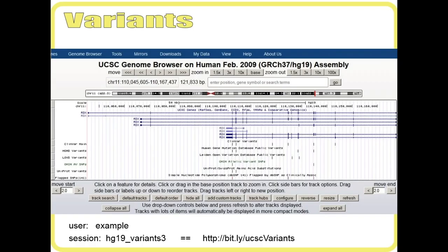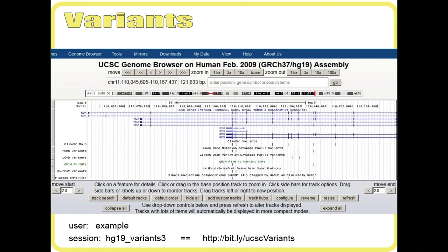For example, the LOVD — Leiden Online Variation Database — is headquartered in Leiden, and there are instances in Australia as individual locus-specific databases. You can see in the browser the RDX gene with several variants present in only one database and some in more than one. You can jump to an active session for this particular region using a URL, and from that location you can zoom around to any other gene to see the contents of those databases.